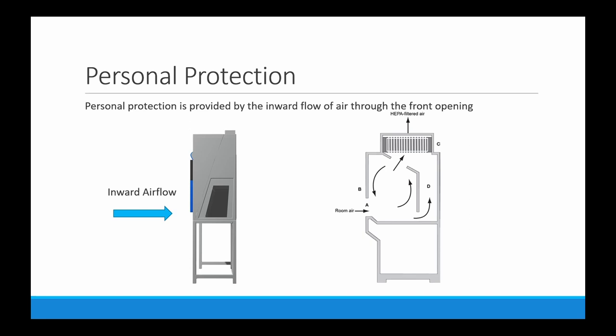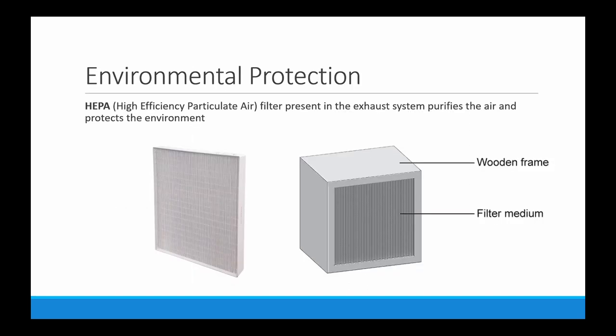Personal protection is provided by the inward flow of air through the front opening. Even if the air is contaminated inside, it will not move out due to the inward pressure. You can see in the diagram how the inward air is flowing and the path of the air inside the biosafety cabinet. For environmental protection, HEPA filters are used in the exhaust system to purify contaminated air which contains infectious pathogens.